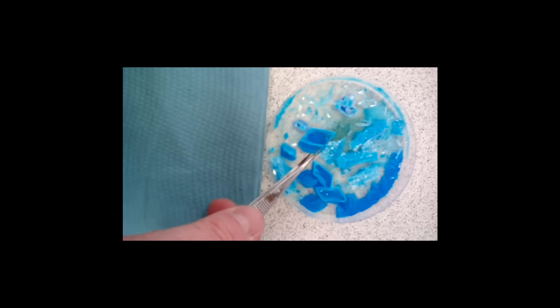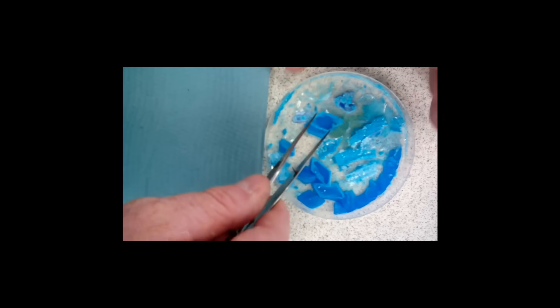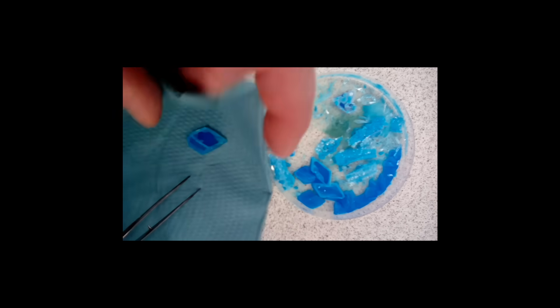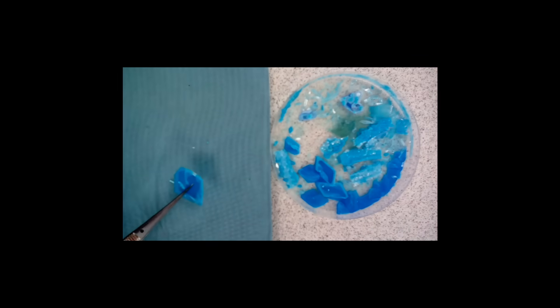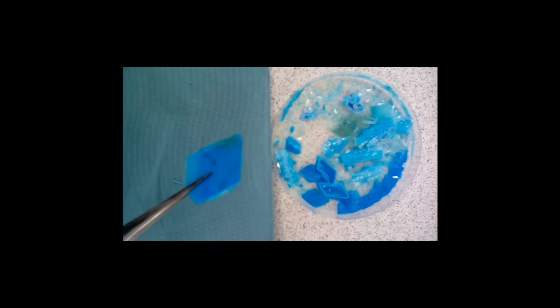Having left the copper sulfate solution to evaporate, we now have some beautiful copper sulfate crystals. The instructions say you should take these out and pat them dry on paper towel. Mine are leaving absolutely nothing behind because I've left them for 48 hours rather than 24 and they are already bone dry — but we have some beautiful copper sulfate crystals.